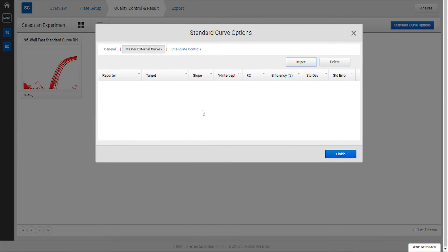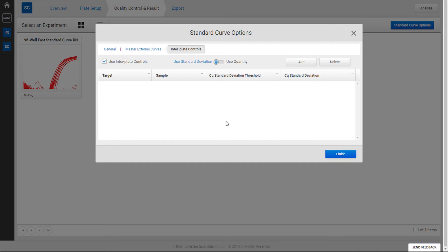The third sub-tab for inter-plate controls is designed to be used as a QC tool to ensure that the standard curves across independent plates are functioning properly.